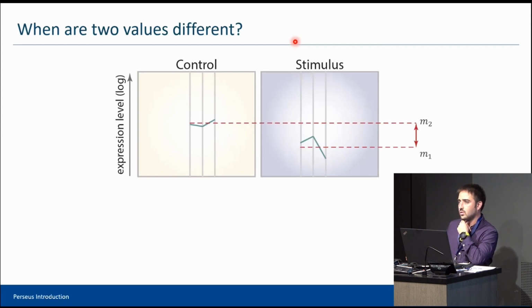Okay, thank you. Another question I had about the multi-omics analysis is how does Perseus deal with missing IDs between protein and RNA? Let's say you have a protein to identify, UniProt has an ID, but if I try to use Ensembl, there's no Ensembl ID for that same gene.